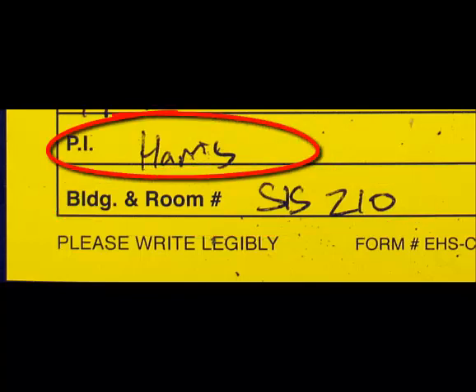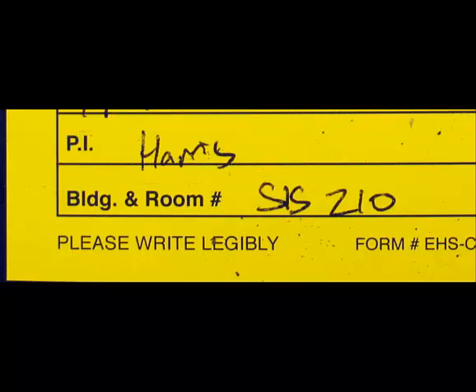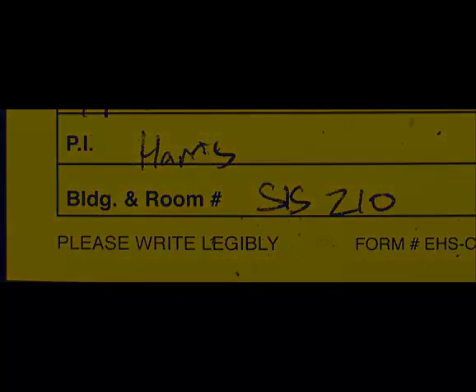Errors do occasionally occur when people label their hazardous waste. If you give us something that doesn't seem to match what you've listed on your label, this section will enable us to contact your lab, describe the contents of the container to you, and hopefully get the waste correctly identified.